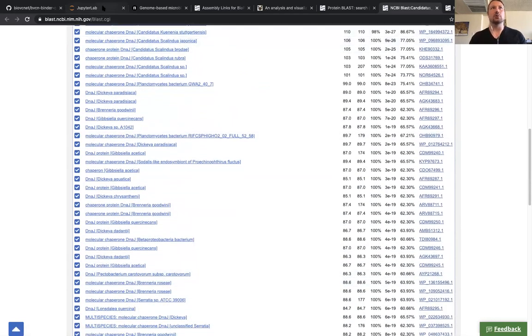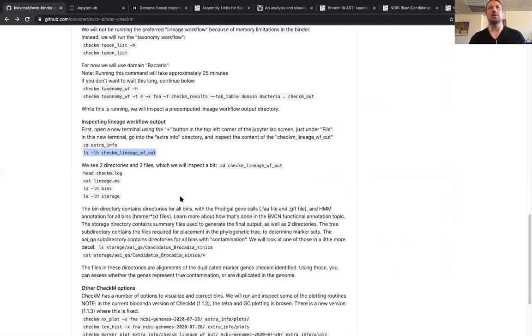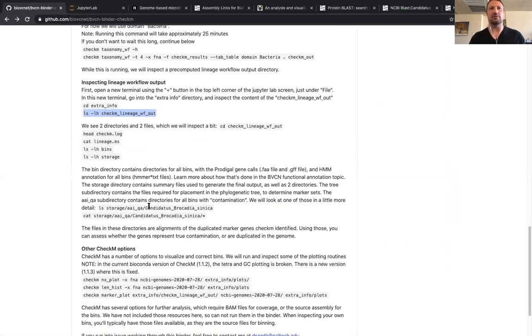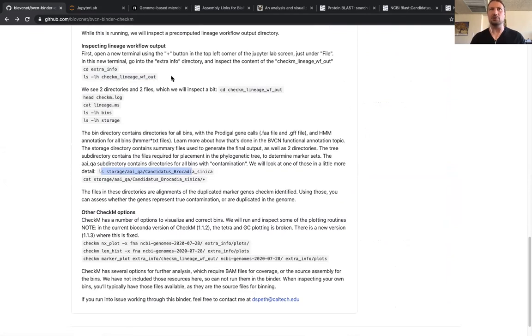Okay, so beyond this, there is a decent amount of other options that CheckM has.